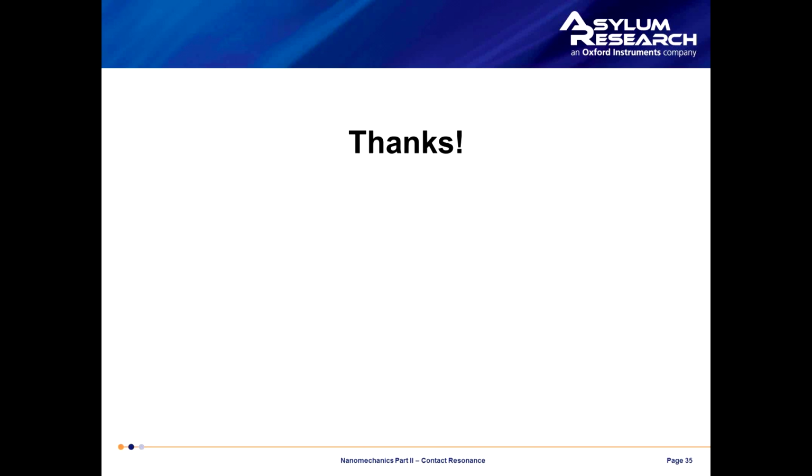That's a good question, and is indicative of the state of the art. This technique, when it was first developed in the late 90s by groups in Japan and Germany and elsewhere, was really intended to address the higher end of the modulus range, the stiff range, because there really weren't a lot of other techniques that could do that. In my own group's work and other places, people have been trying to drive that down because of all the interest in nanomechanical properties of polymers. So right now, we've extended the technique so that we feel comfortable about our methods for getting good numbers in the few gigapascal range.